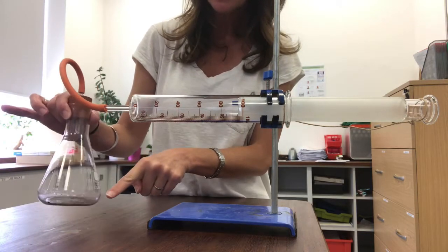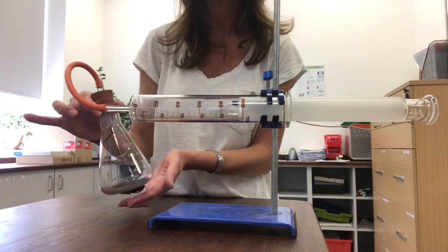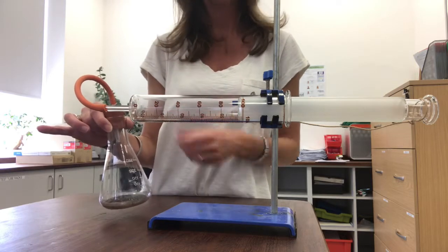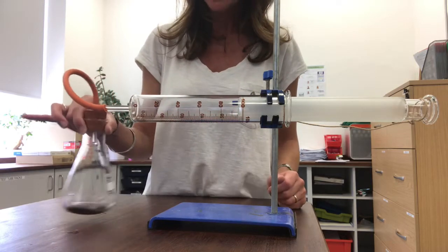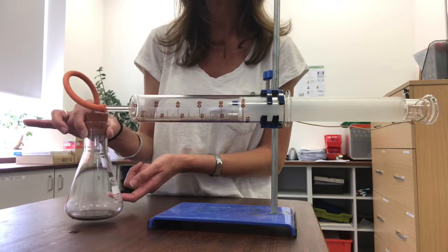Inside my flask here I've put some iron filings. Now I chose to use iron filings rather than iron wool this time because they've got a larger surface area, so I'm hoping they're going to react a little bit faster. So I've got iron filings in there and a little bit of water just to make sure there's enough to help them rust.